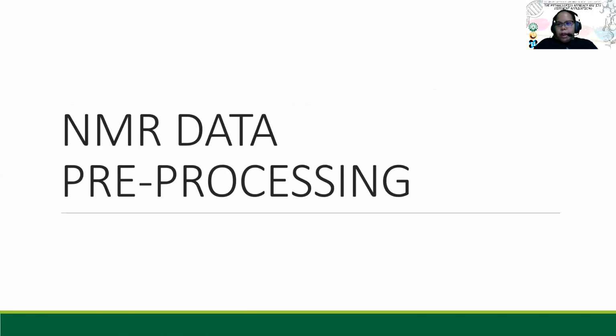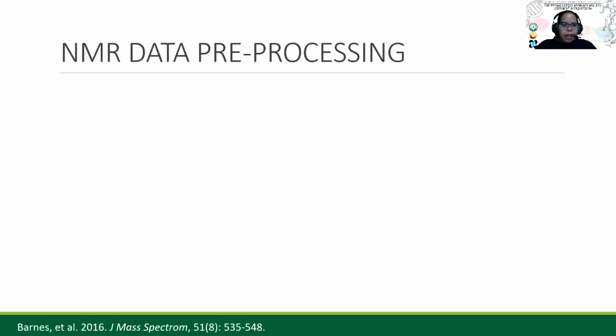Okay, so we'll talk about data pre-processing. NMR-based metabolomics and MS-based metabolomics will have different pre-processing steps. And so now we'll cover first the NMR data pre-processing.